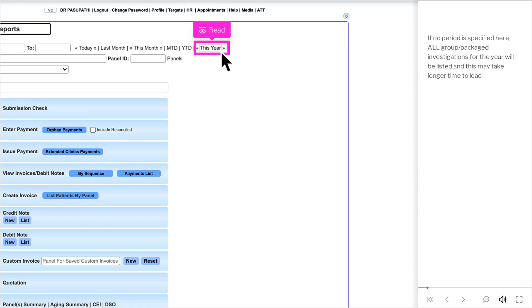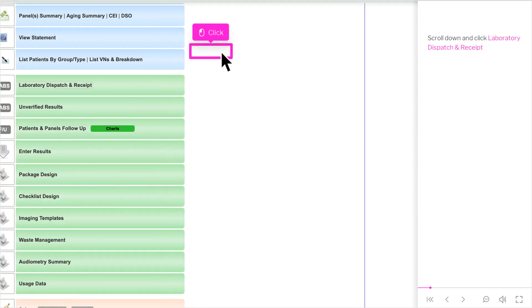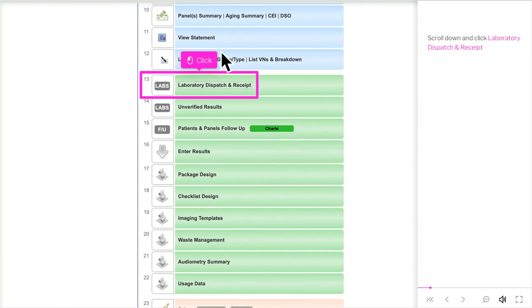If no period is specified, all group or packaged investigations for the year will be listed and this may take longer to load. Scroll down and click Laboratory Dispatch and Receipt.